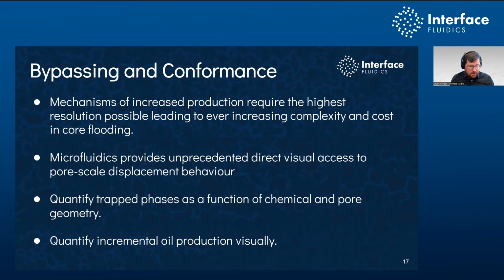Going beyond understanding just fingering effects and displacement characteristics, we can actually quantify trapping of different phases, whether that's oil or water, as a function of the chemistry or pore throat geometry. And I'll show you some images of that in a minute here. And finally, obviously, just being able to incrementally understand oil production.